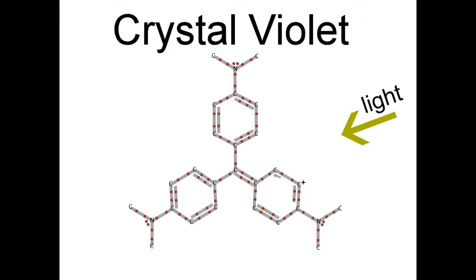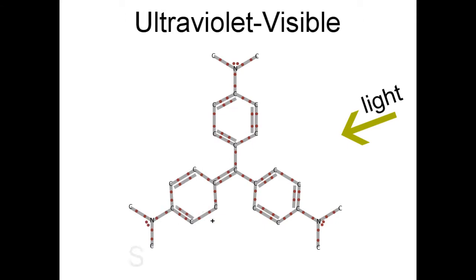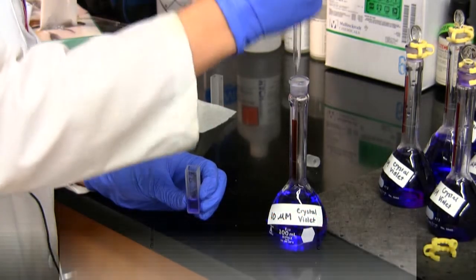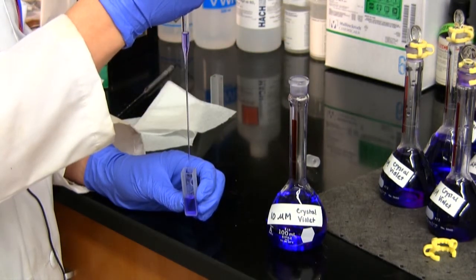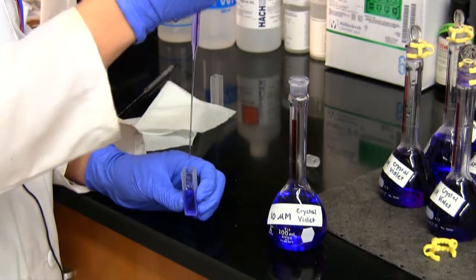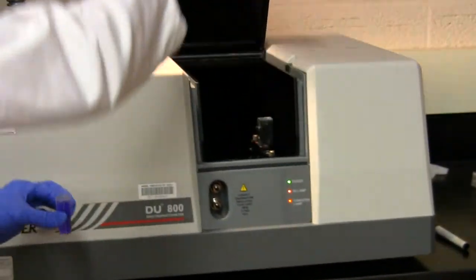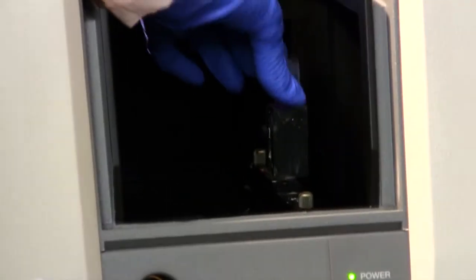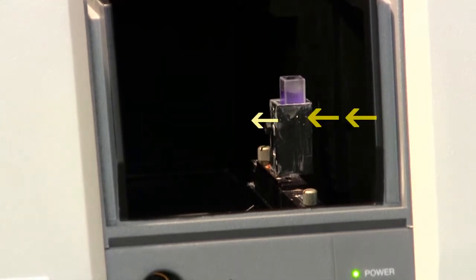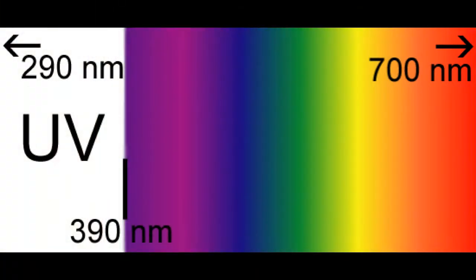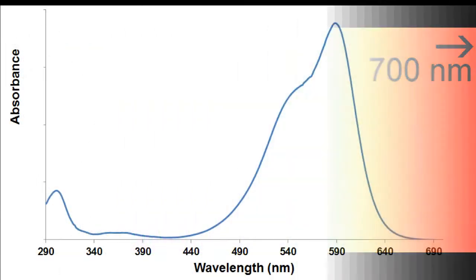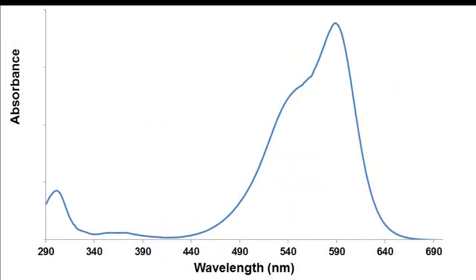But you don't have to take my word for it. We can actually measure how crystal violet absorbs light in the laboratory using an instrument called an ultraviolet-visible spectrophotometer. So let's do that. First, we have to put some of our solution into a cuvette. We then place the cuvette into the holder inside the spectrophotometer. When we take a measurement of our solution, the spectrophotometer will send a beam of light through our solution at whatever wavelength is set. For this experiment, I have set the wavelength range from 290 nanometers to 700 nanometers. Now we can see the data that the spectrophotometer produced — it appears that our solution absorbs light over a range of colors, and the peak absorption is at 590 nanometers.